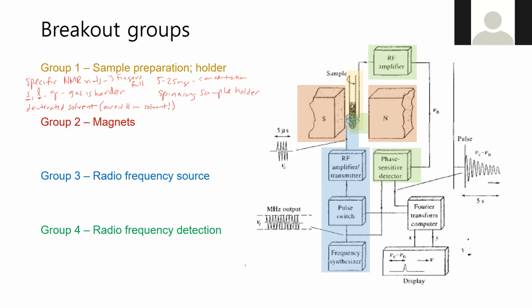So I mean, they're not always spun necessarily. Spinning them, I mean, it can have, I guess, a small effect on the homogeneity of the actual sample, but it also helps out the homogeneity of the magnetic field as well.